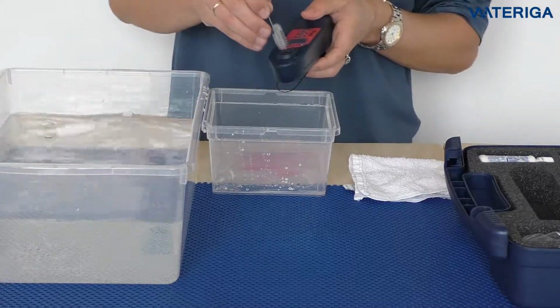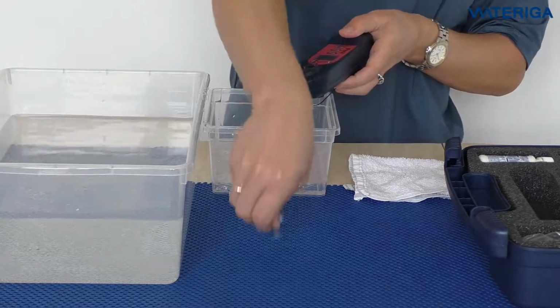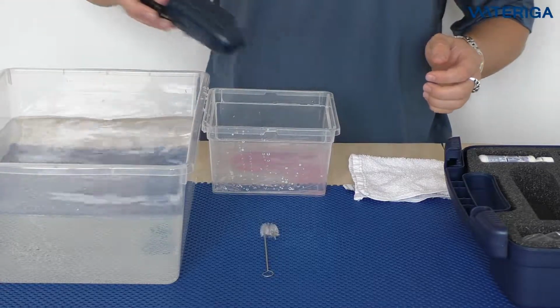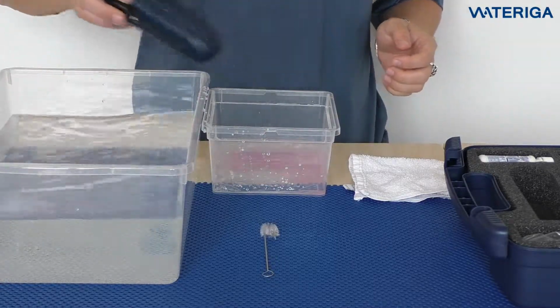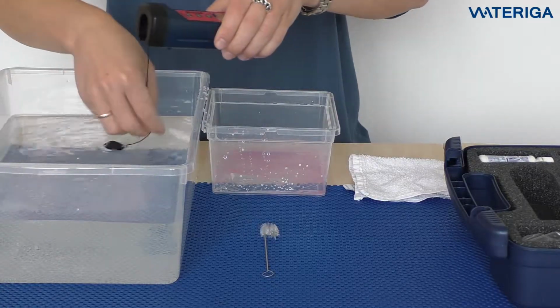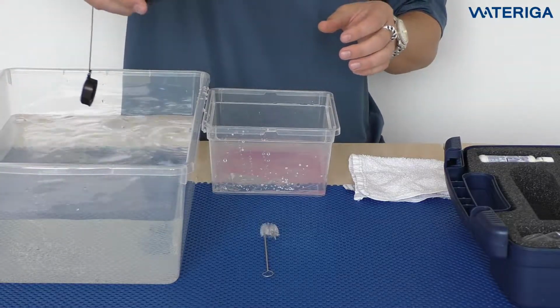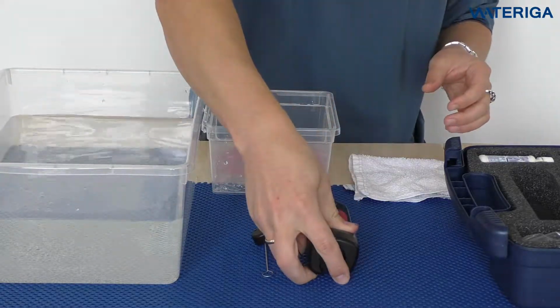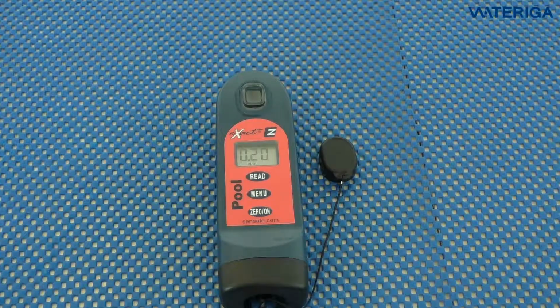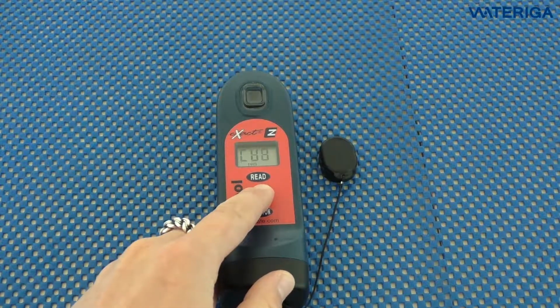Get some fresh water in, brush the cell with a brush. Rinse out the cell 3 times. Rinse out the cap. And then fill it up to the top. Let's move on to the pH test. I'm going to press and repress the menu button until we see pH 2.